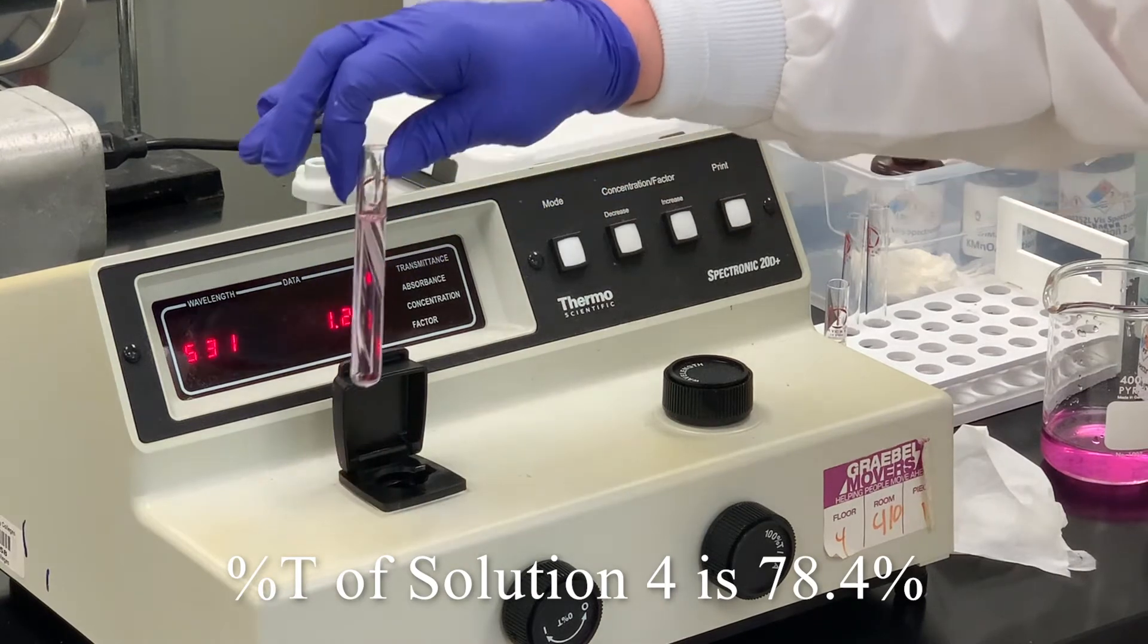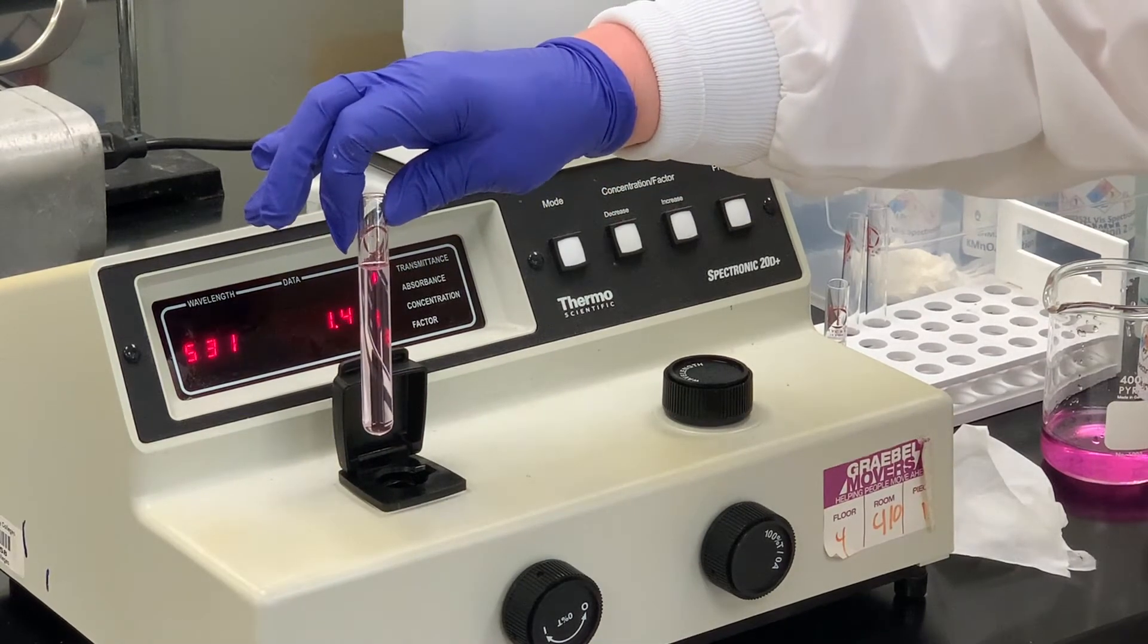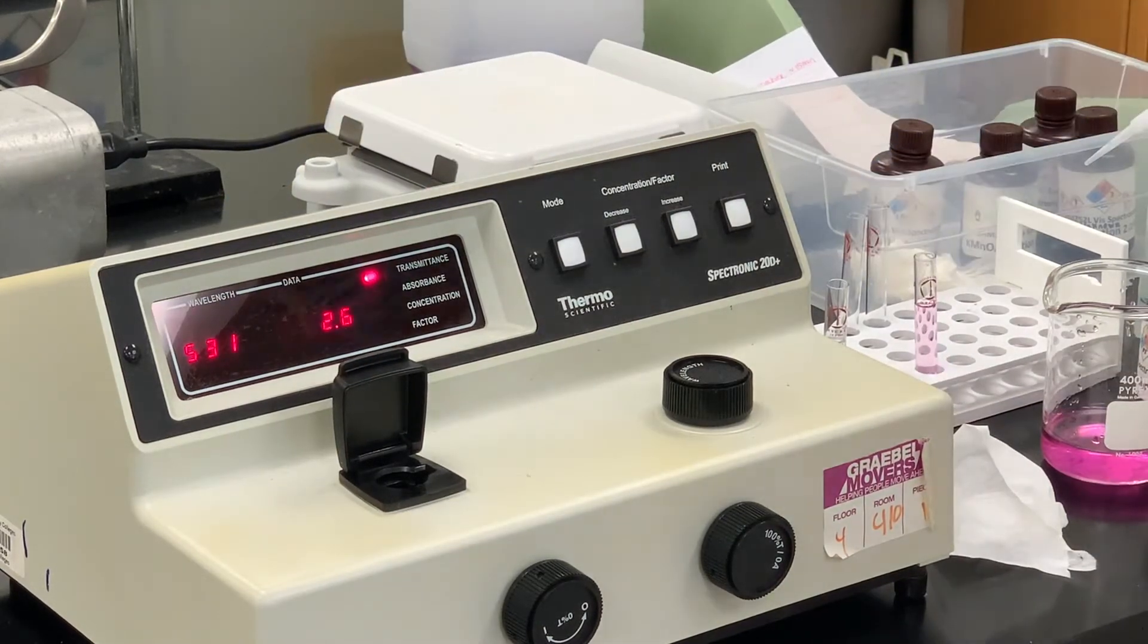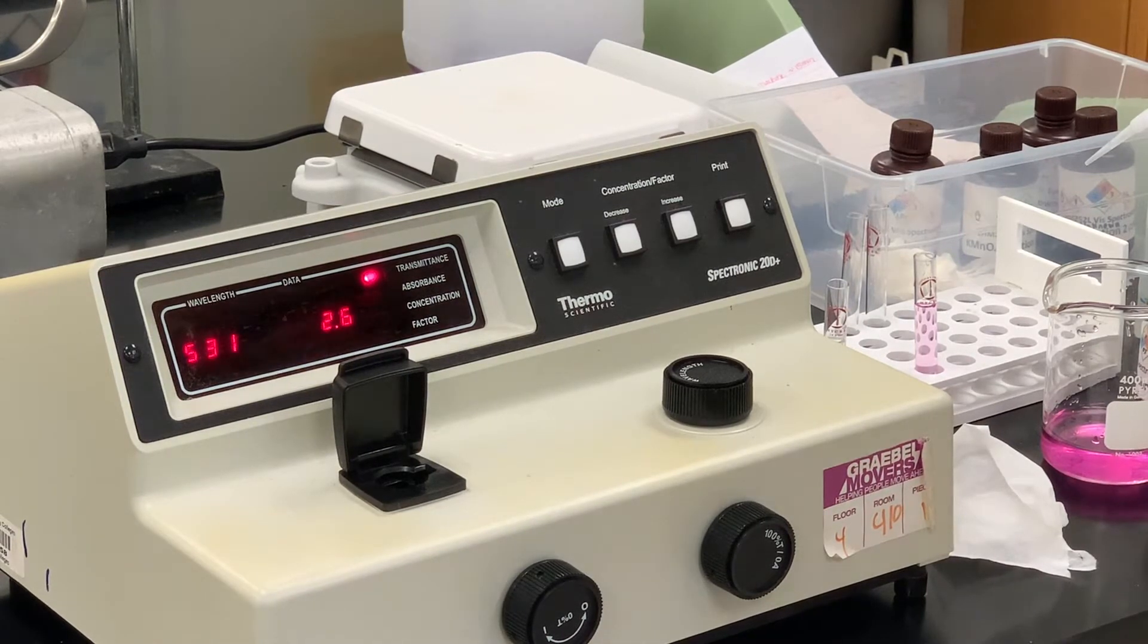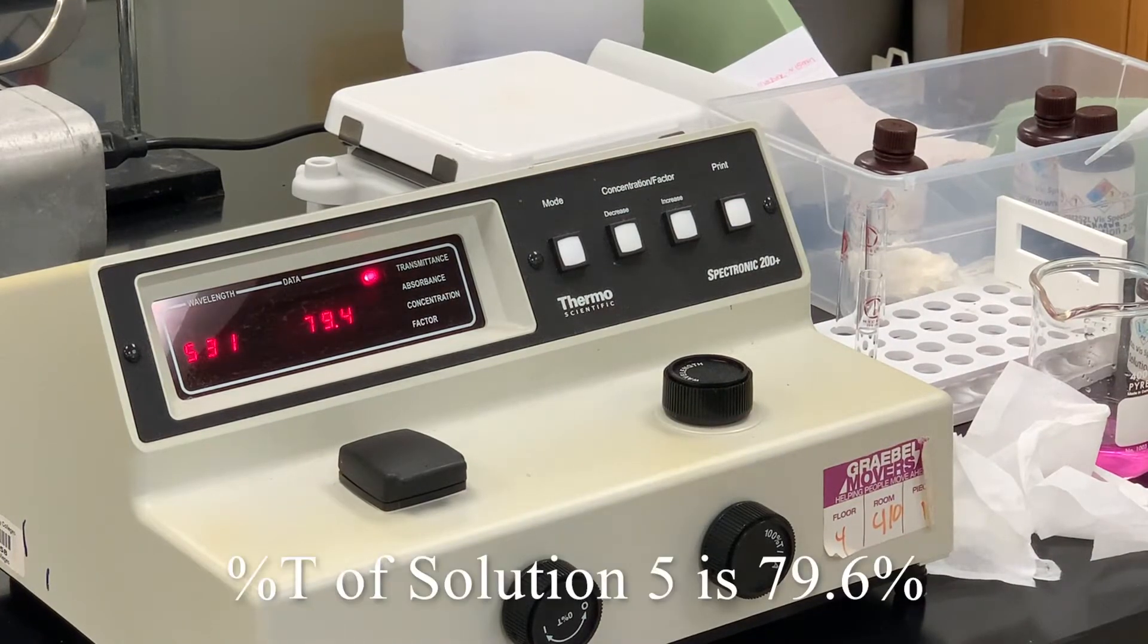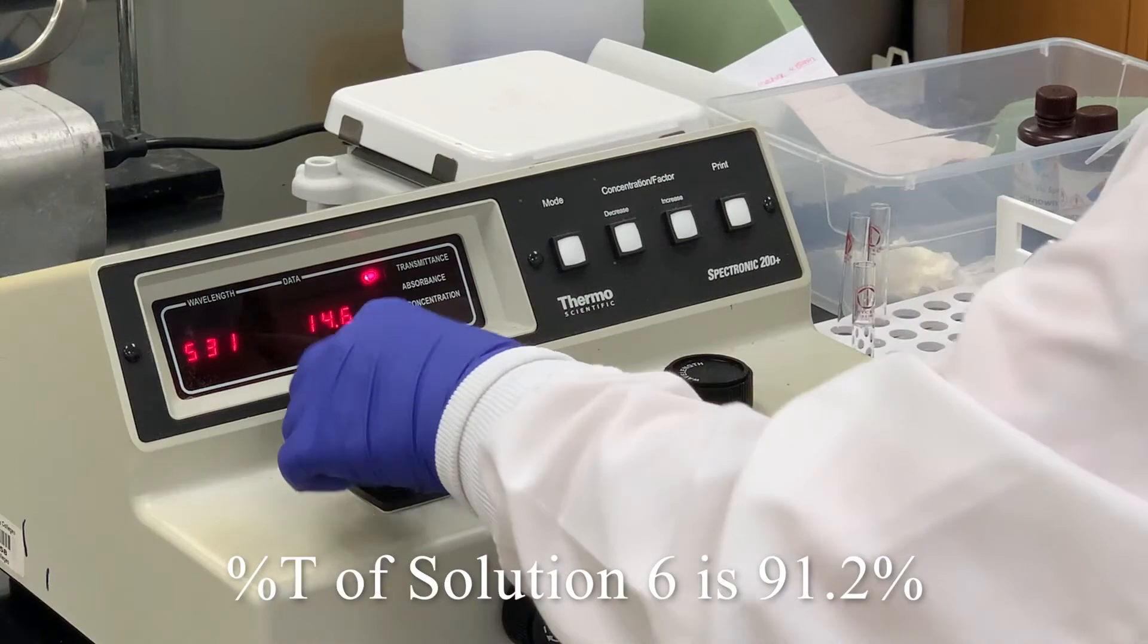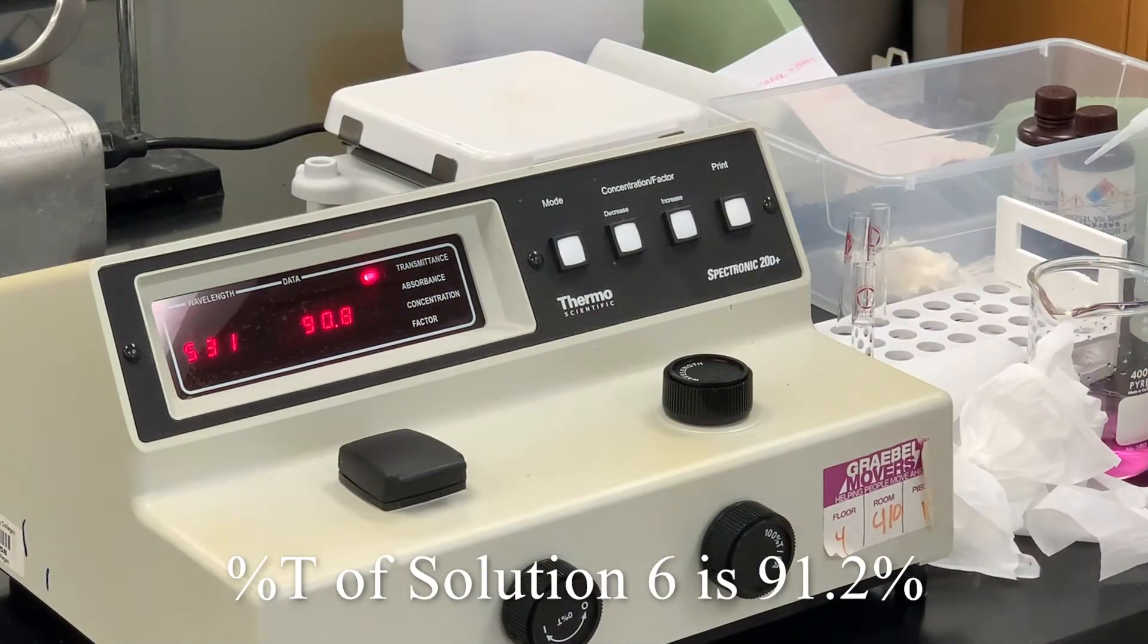And you probably can feel that as we're going to these higher solutions that they're getting more dilute, the color is less saturated, which makes sense because how much light is being absorbed is going to be dependent on the concentration. And solution five now is 79.4. And solution six is 91.2.